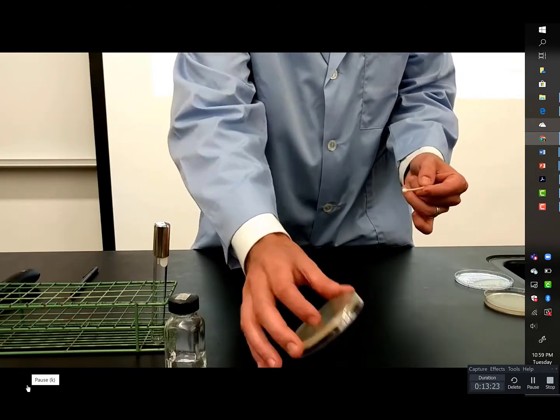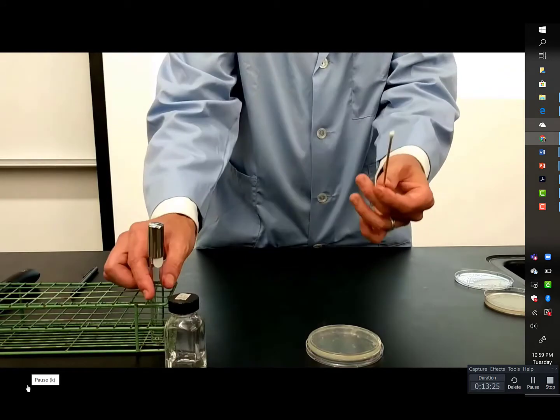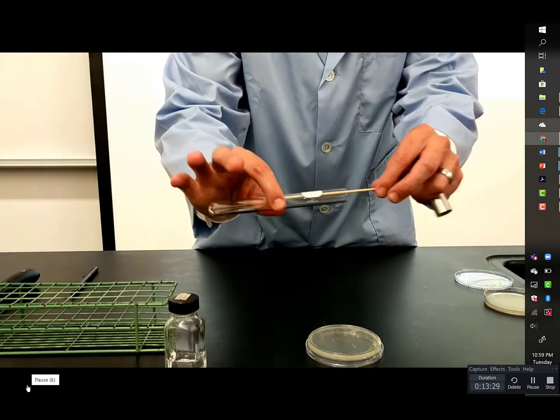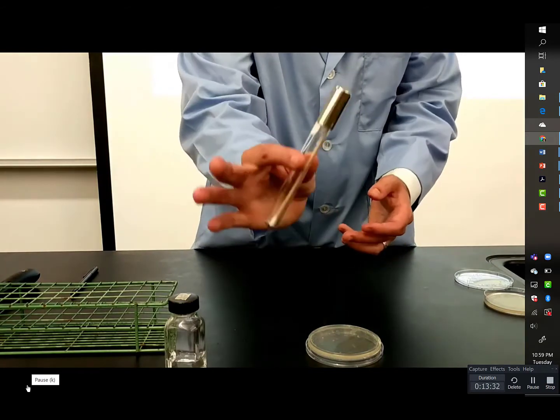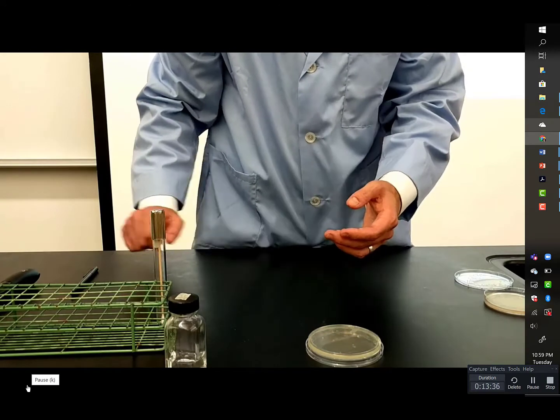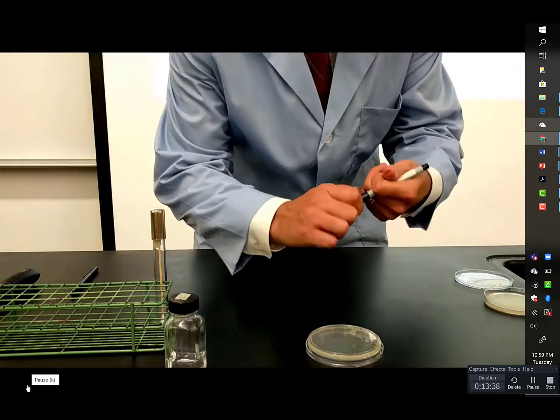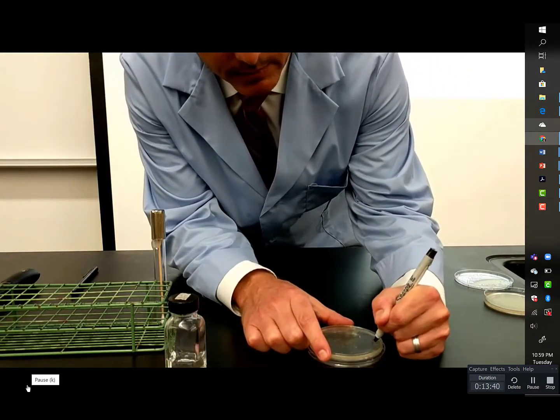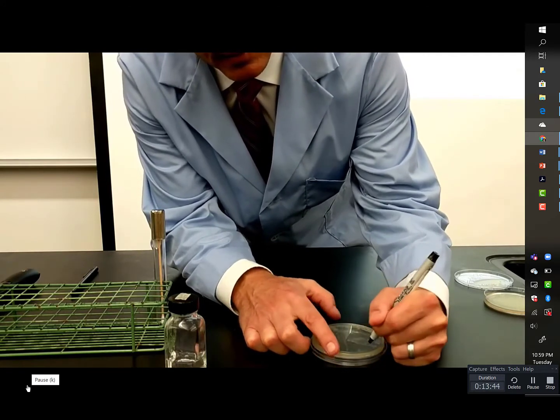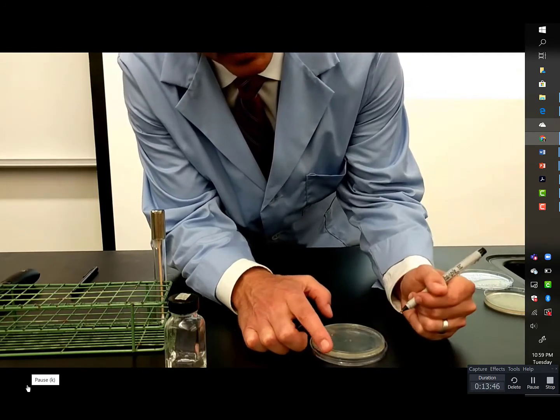Okay? And so now I go ahead and I take my used swab and I put it back into the container that it came from, all right? And then I need to relabel this. So this was my cell phone, and I'll put my initials there.